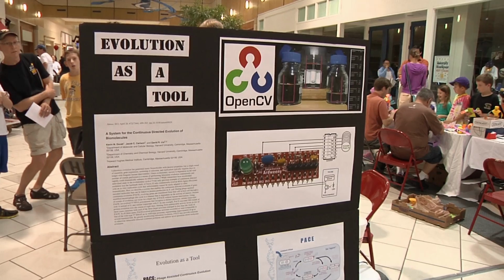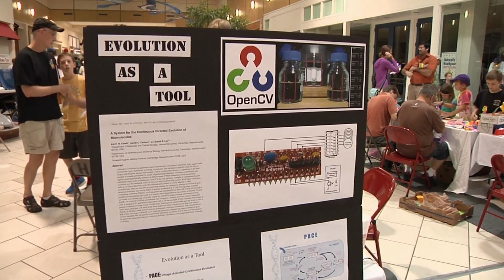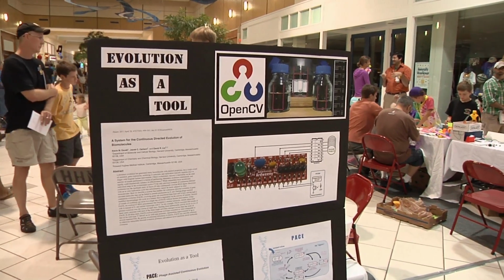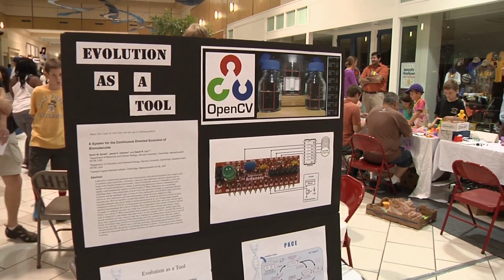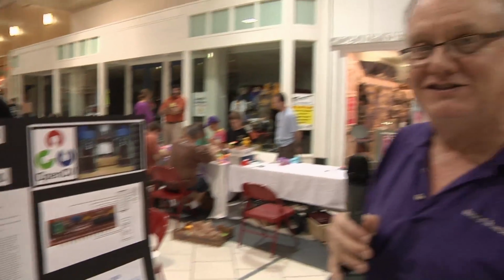And a friend of mine at UNC who wants to use PACE to evolve a protein is very happy because he wants to build 4 of these apparatuses, and now we're talking about $2,000 instead of $100,000. So I get my kicks building stuff from the scrap exchange out of cheap parts or discards, and I'm the engineer at the Museum of Life and Science, and this is what I do in my spare time. I've been interested in molecular biology for all of my life and been on the fringes of it and do little projects like this. So that's evolution as a tool, or open source evolution as I like to call it.